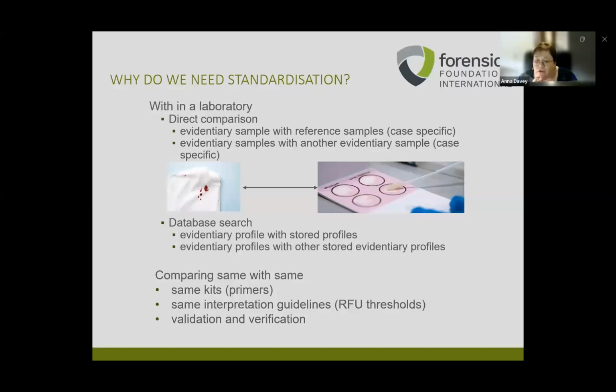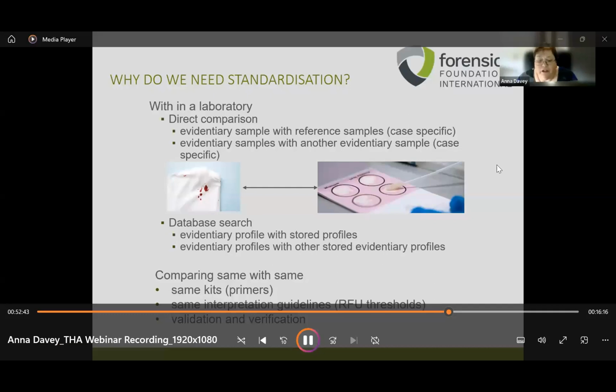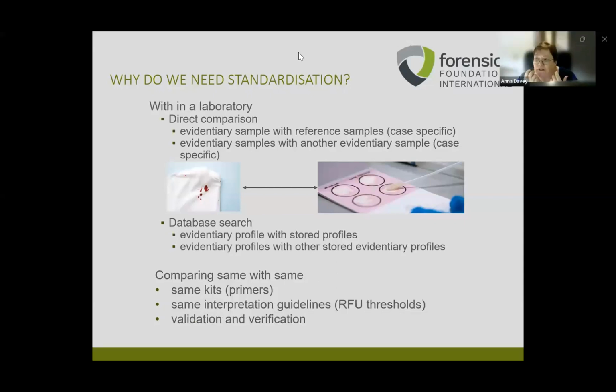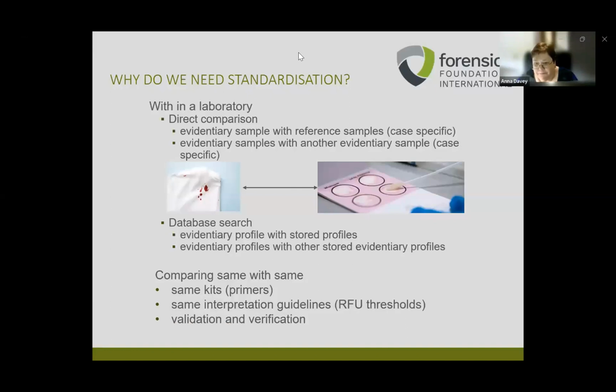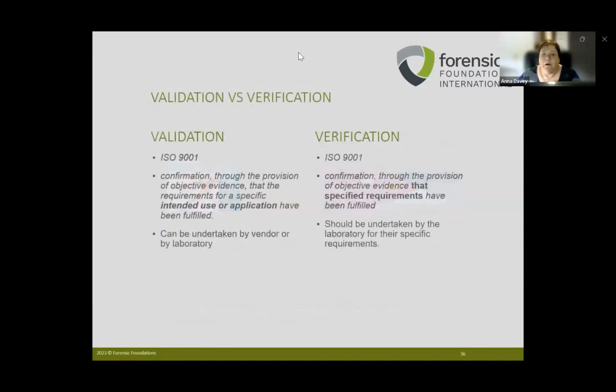All right, so these are your own interpretation guidelines, and they'd be used consistently. What the laboratory has done is validate and verify their analytical testing within their organization, how it works for them. Now, this is where I said I'd mention the difference between validation and verification, because they get mixed up quite frequently. So validation: these definitions are out of ISO 9001.